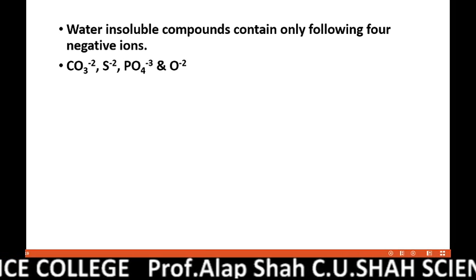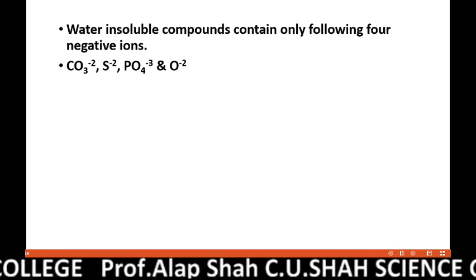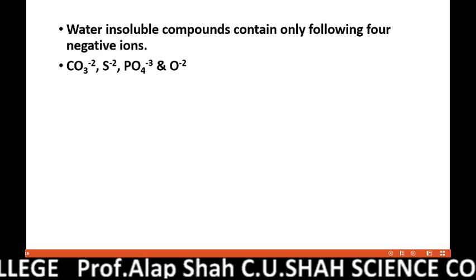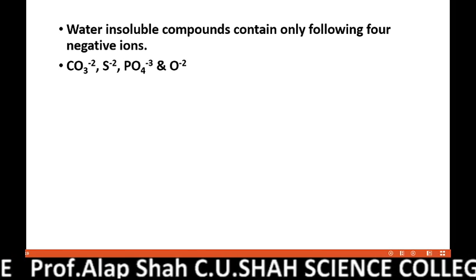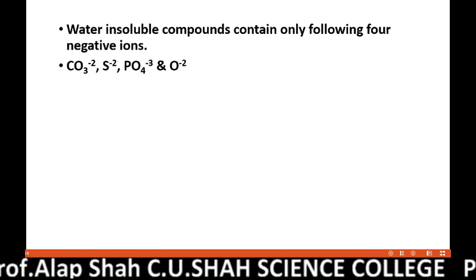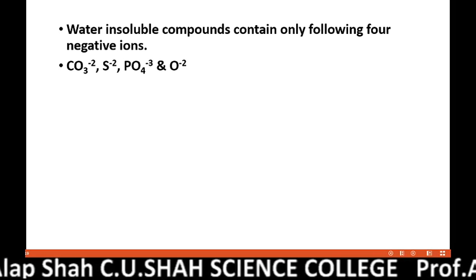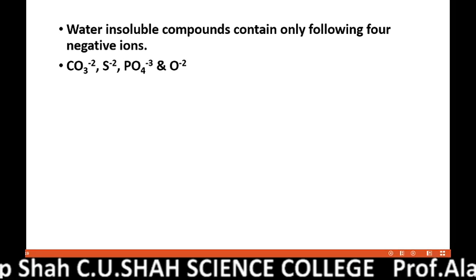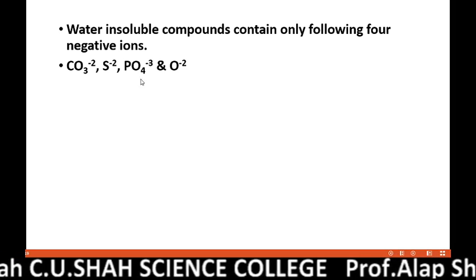In my next presentation, part 4, we will discuss how to prepare the solution, because you are given a ready-made solution here, and here you have to prepare the solution. There are a couple of methods of preparing the solution, and once the solution is ready, then the remaining part is a repetition of what you did in the 12th standard. So I hope that you understand this.